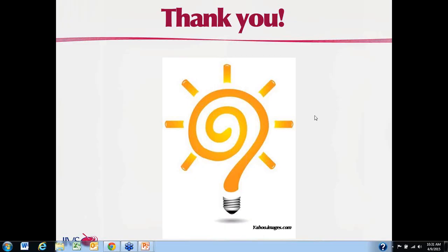Okay, could you tell us a little bit about the software that we're using for the data analysis and where you can get it? The software that we're using is the Phototox 2.0 software provided by ZBET. You can find more information on this, I believe, in the OECD test guideline website. We'll provide a link to that when we send out the written Q&A form.